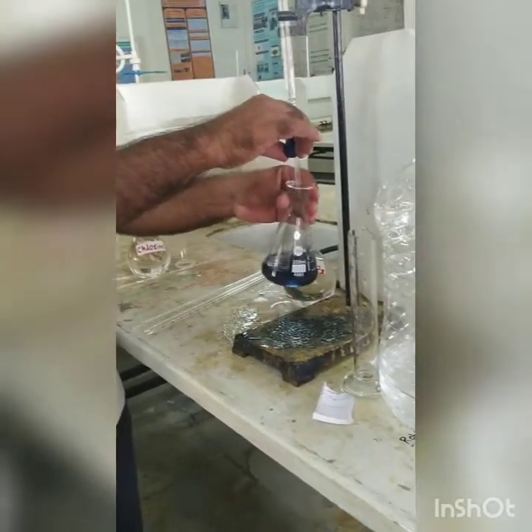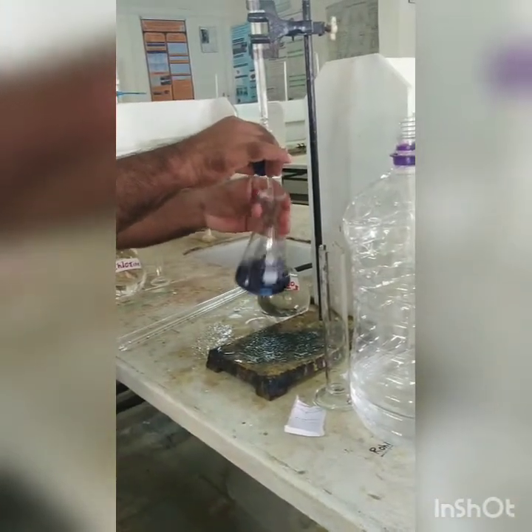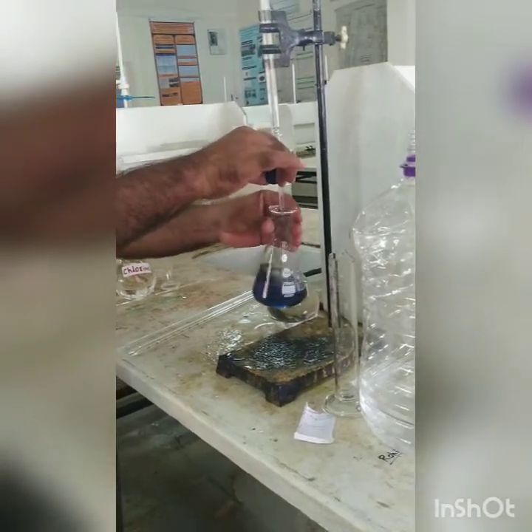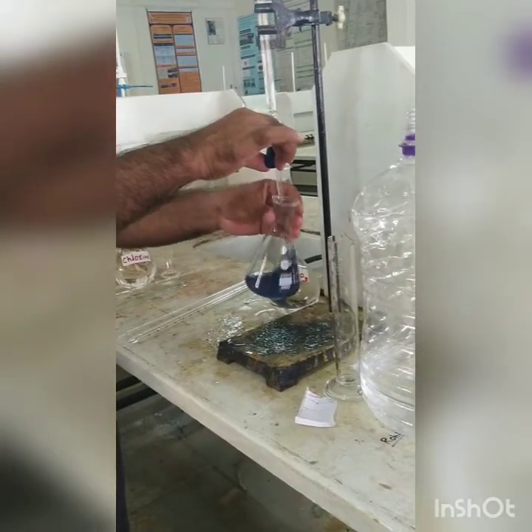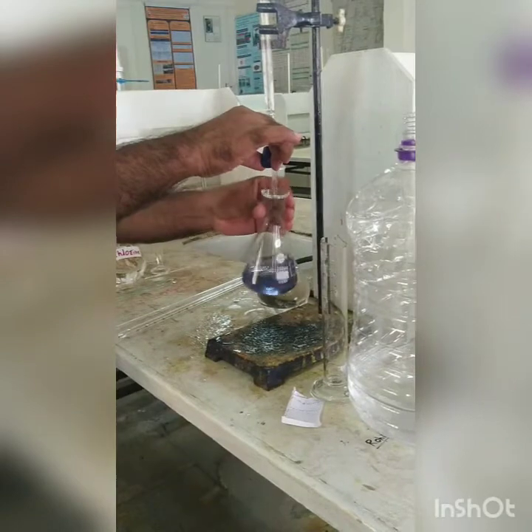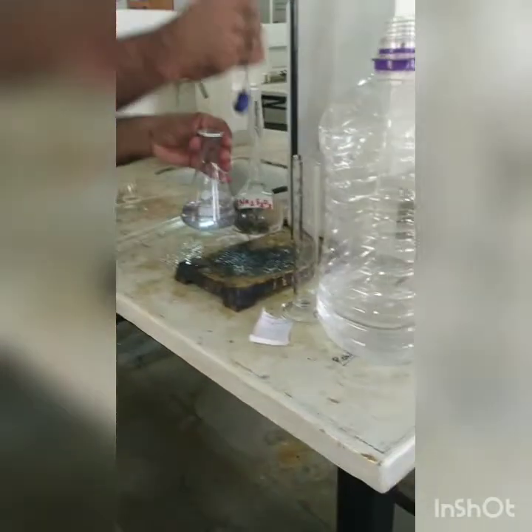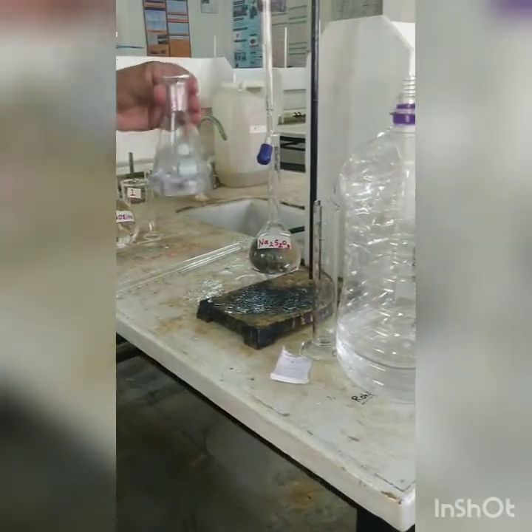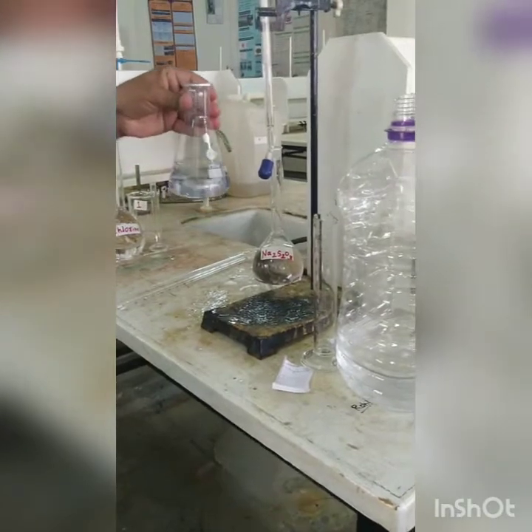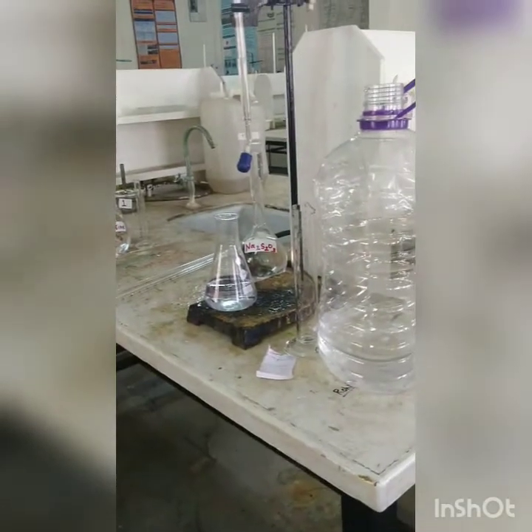Now, in the example they have mentioned that if the concentration of chlorine is 100 mg per liter, then how many mL we have to add so that our dosage will be 0.5, 1, 1.5 and 2 mg per liter. So our dosages are fixed. What can change is the concentration of chlorine in the given chlorine solution. How much is the reading? 20. So this Y we will be using for calculating the concentration of chlorine in the given chlorine solution.